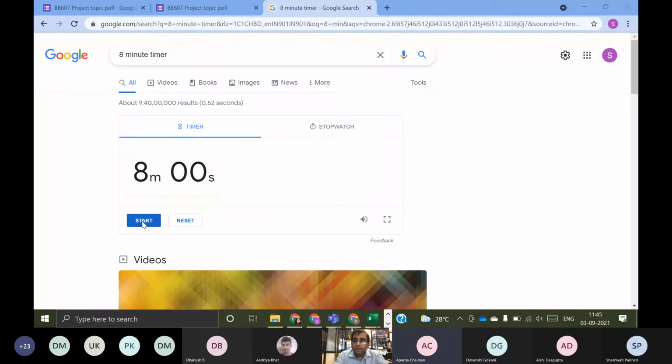So let's start with the data file which has been given to all of you. Please start the analysis with MetaboAnalyst, and the time given to you is 8 minutes. Go through the steps the way we have done in the previous steps, and then we will talk about your output and what is expected from that analysis. Yeah, so your time starts now.